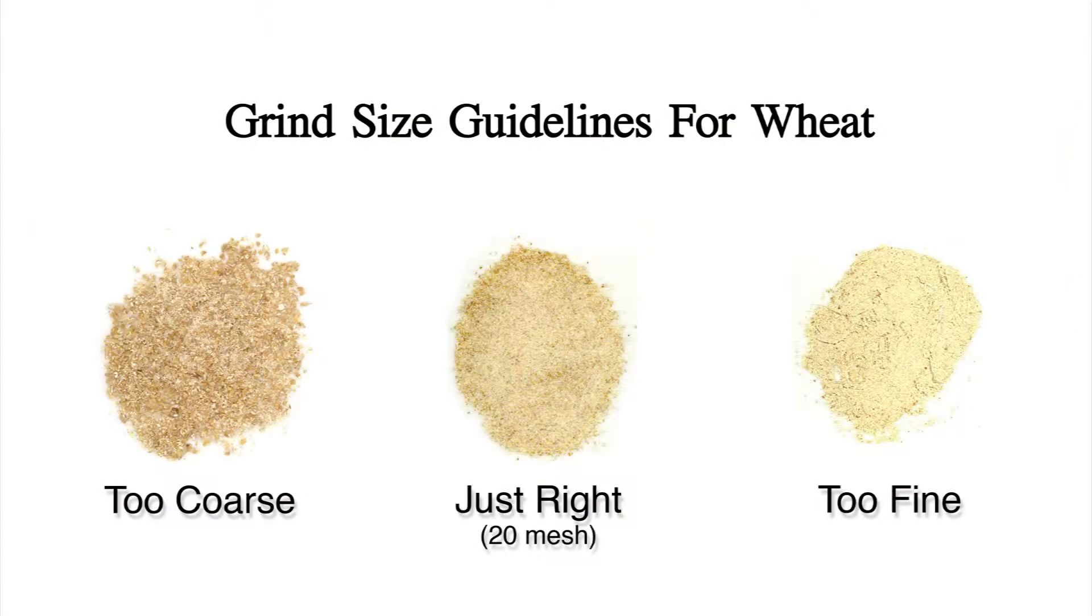If you wish, you may sieve the mixture in a 20 mesh sieve to check for proper grind size. Most but not all of the sample particles should easily pass through the sieve and have the texture of fine sand. Be careful not to grind the sample to a powder.